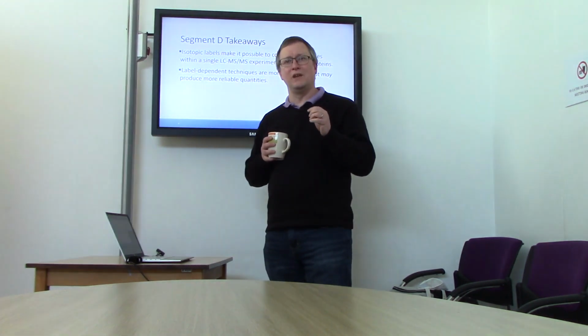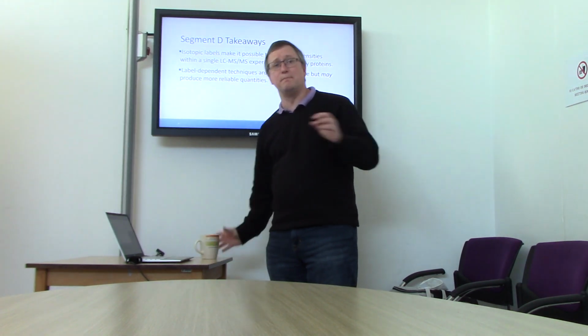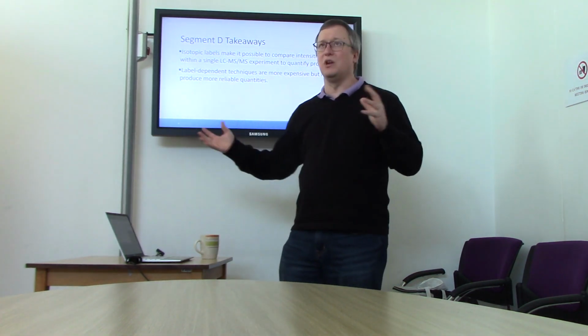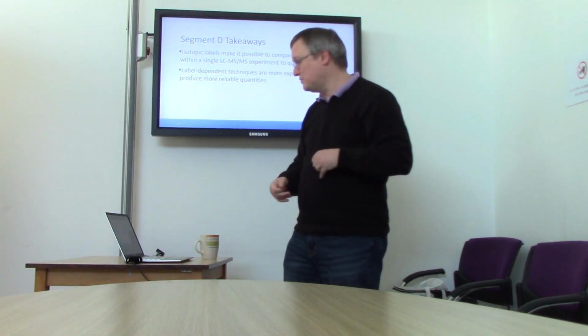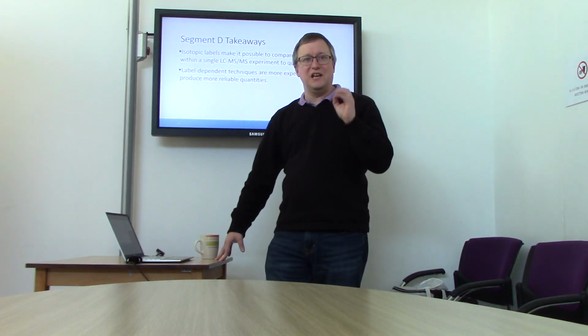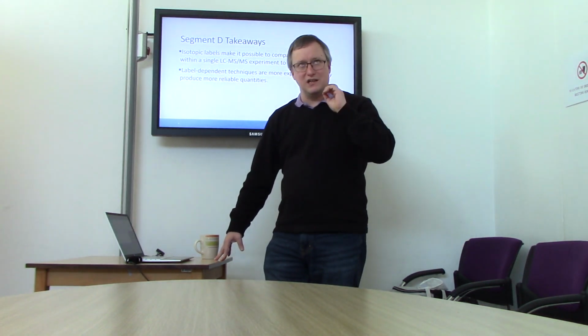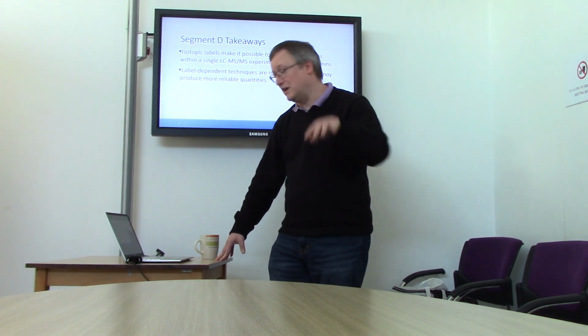Where before, I might have a single LC-MS experiment that represents multiple samples pooled together or combined in a way that they can only be differentiated by their isotopes, we change to a place where each LC-MS experiment is about a single sample, which means we must compare across LC-MSs.